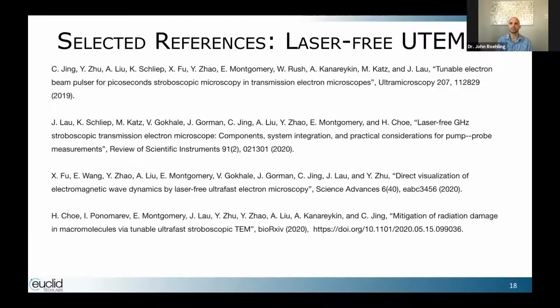When you're talking picoseconds or femtoseconds, it's just very difficult to get that level of accuracy in the timing, where it's easier to set up a translation stage to delay your laser beam by a path length. If you're talking femtosecond time delays, it's about a micron of distance per femtosecond. It's a very short distance.